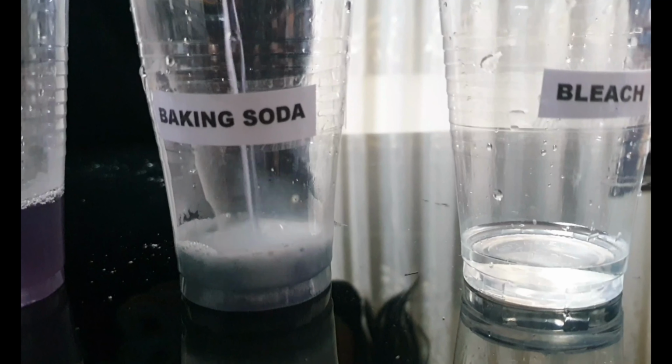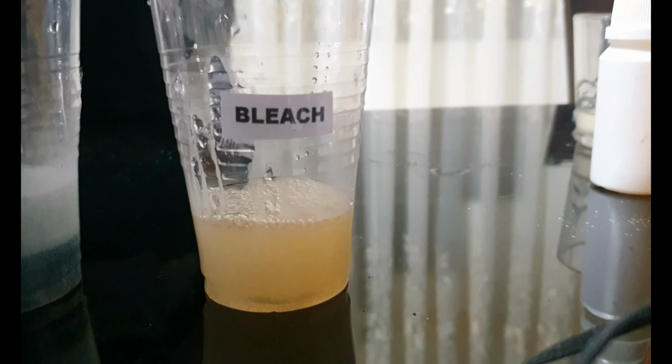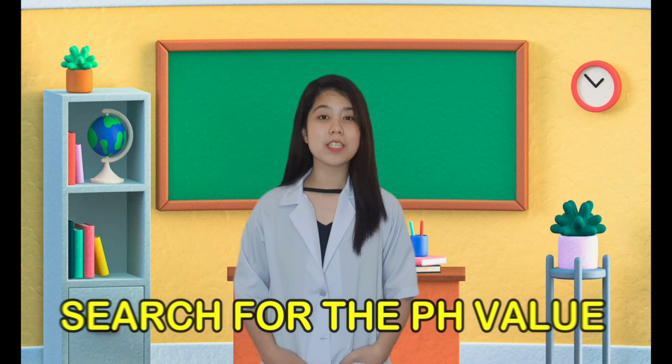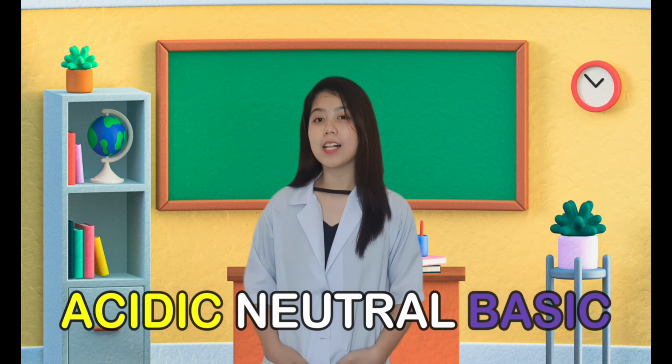See? The color of the solution is changing. Make sure to record this beautiful event. You can also add more if you want it to be more vivid in terms of colors. Wow, that's amazing! Indeed! Now, we will search the pH value of the samples. Based on our experiment, refer to the color change happening in the solution and determine whether the solution is acidic, neutral, or basic. That is so easy, what a way to determine the pH level.